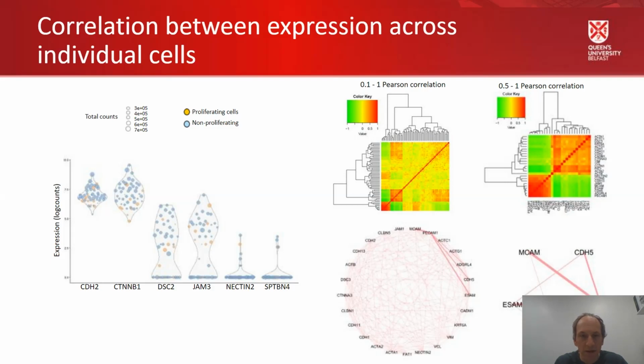So those are a small number of genes that seem to center on PCAM1 that are expressed at similar levels together. So we need to be careful not to overinterpret this, but it at least is suggestive evidence that these genes may be functioning together, and that this is something we can then investigate further.